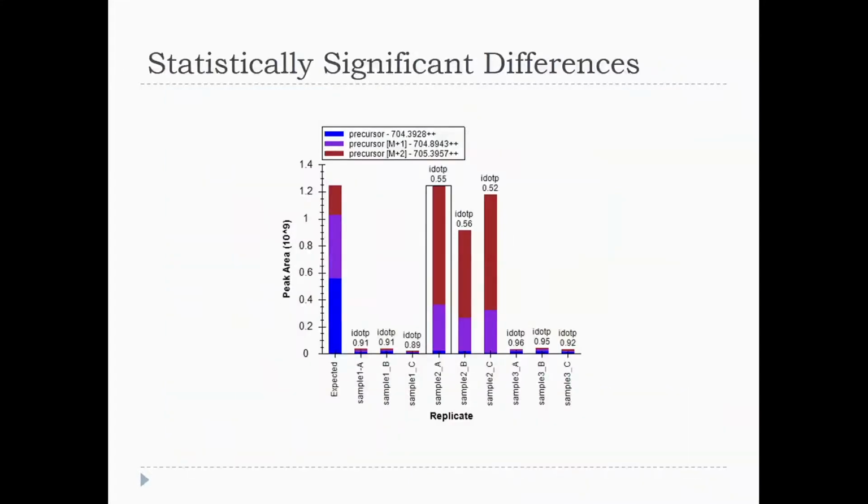This is a graph from a data set where the experiment was yeast background. 6 proteins were injected at various levels, and this was an ABRF iPRG study, an informatics Proteomics Research Group. They set up this experiment, and then they sent it out to people and said, tell us what's changing. Tell us the proteins that are changing in here. So what I did was I took all that data and looked at what peptides are statistically changing, irrespective of the proteins. Let's just look at the peptides.